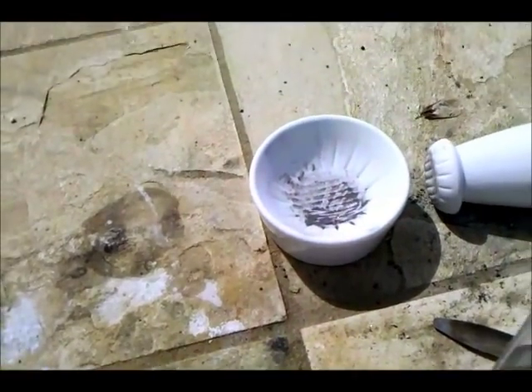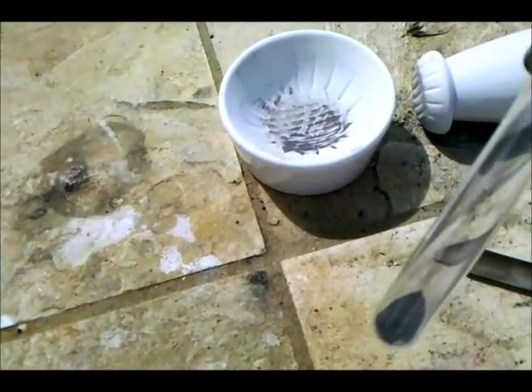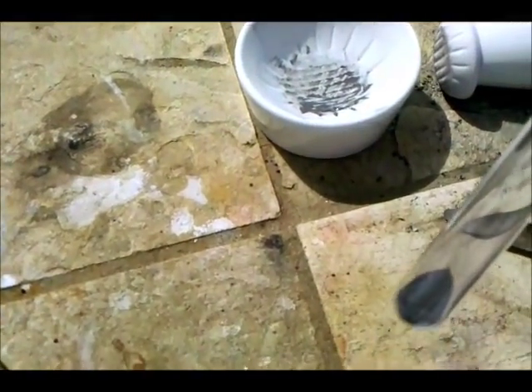Hey everyone, in this video I'm going to be showing a cool reaction between elemental silicon and sodium hydroxide. That produces a lot of hydrogen very fast and some sodium silicate.